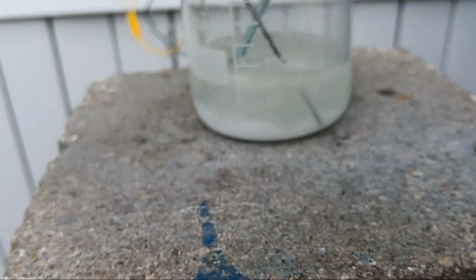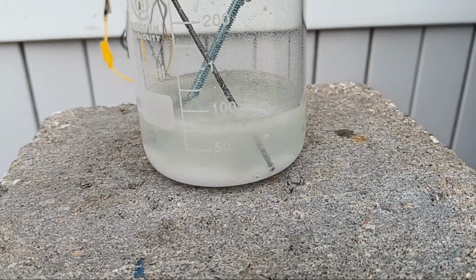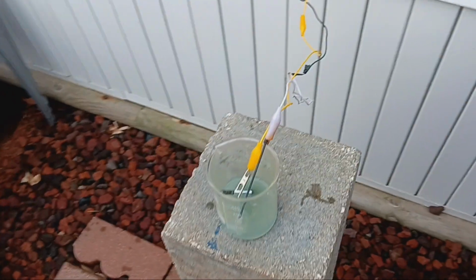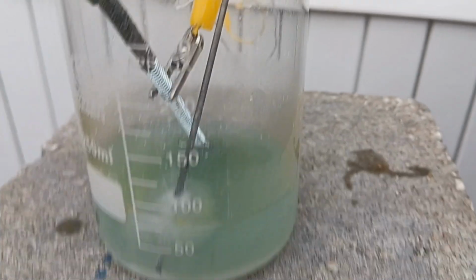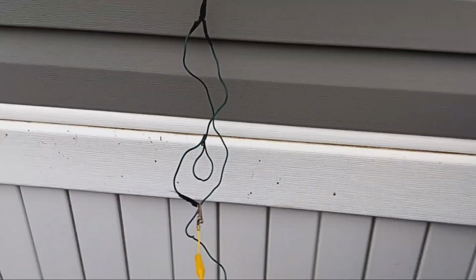This does not occur at the graphite electrode, which is very inert. A very interesting phenomenon that has occurred here is the liquid is turned green. This is described as a green rust, according to Wikipedia.